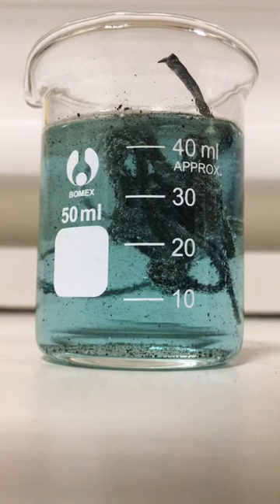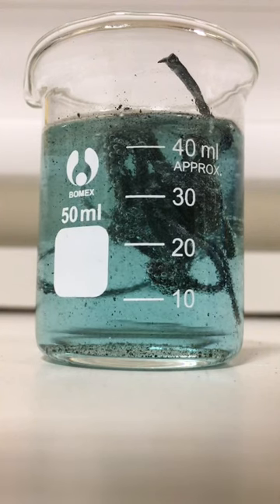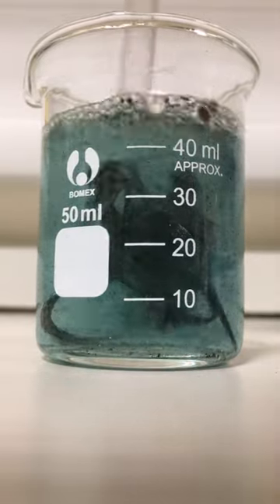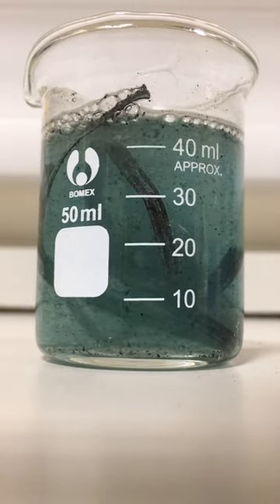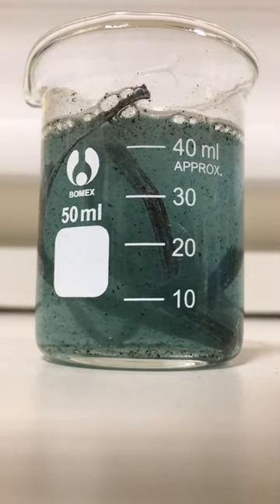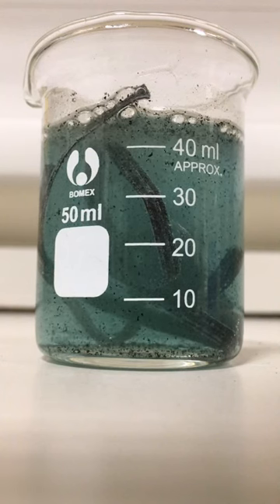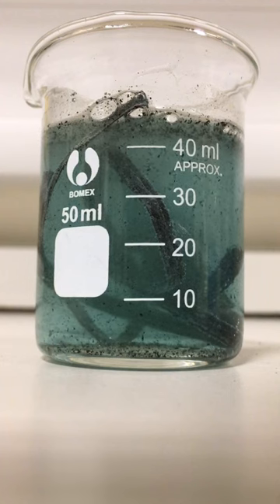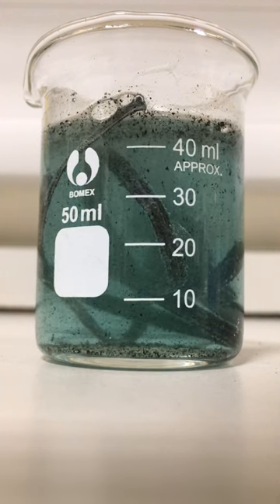Why does the colour fade? Because the copper 2+ becomes copper metal. You can see that being precipitated, liberated at the bottom of the beaker. These brown bits are solid copper, and we can also see the magnesium is disappearing. The blue goes because there's no copper 2+ left in solution, or there won't be as this video progresses, and hopefully all the magnesium will be gone within the space of about the next 5 minutes.